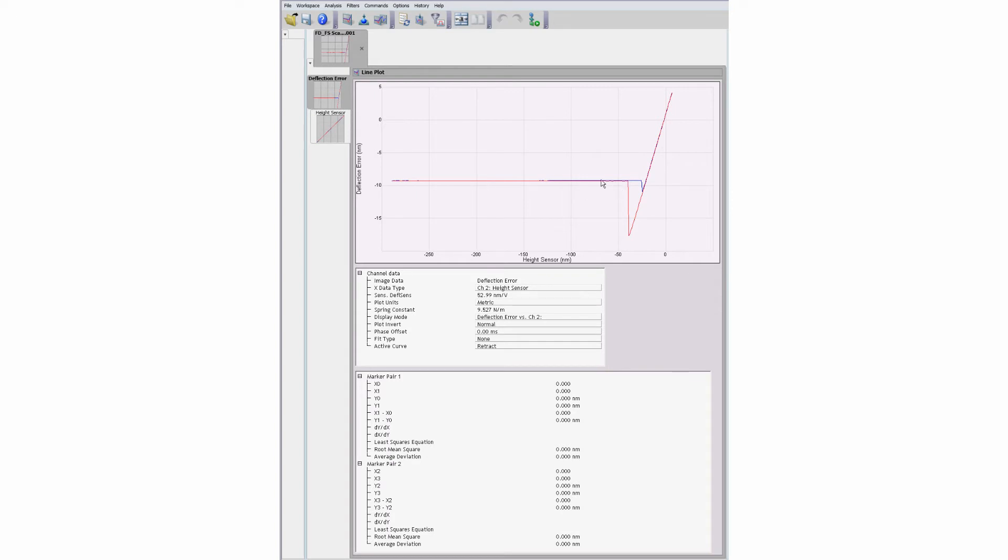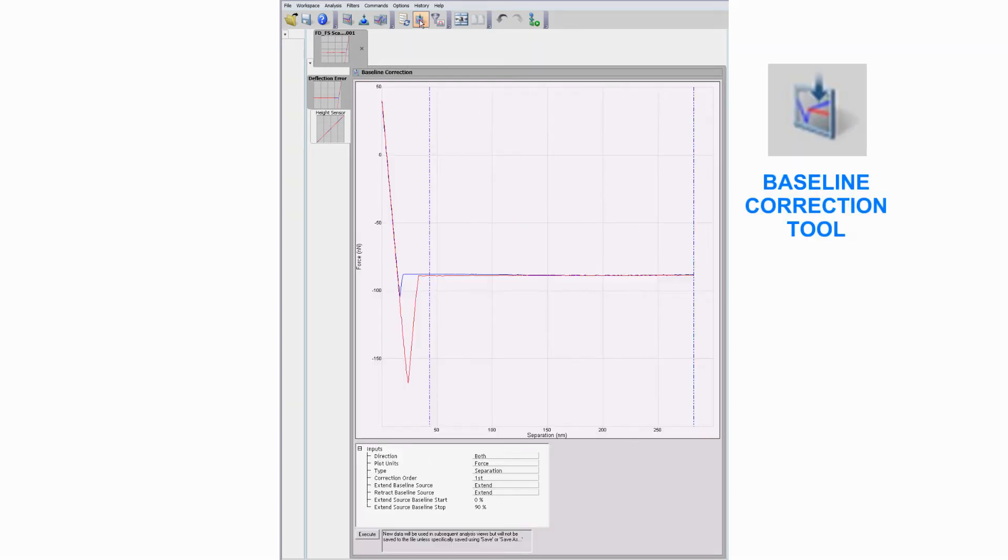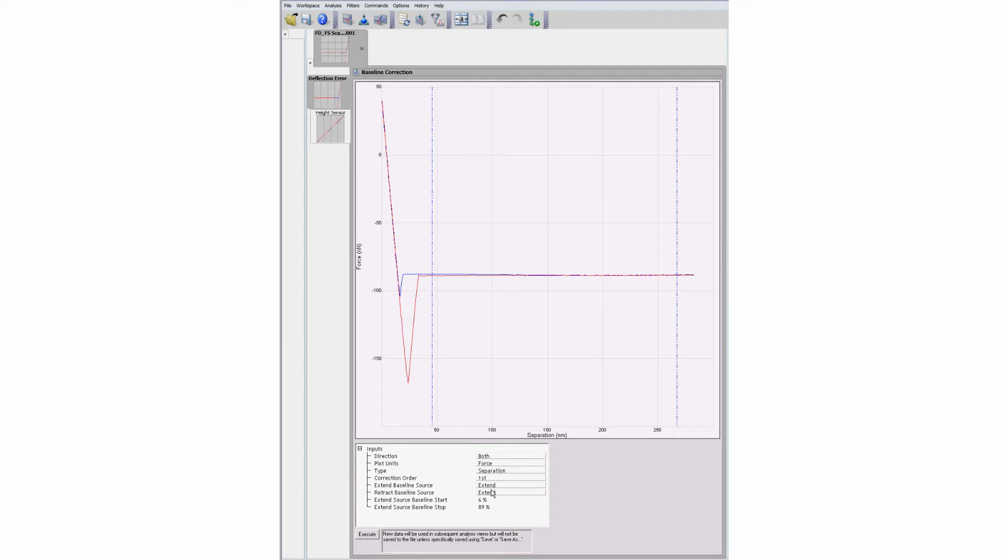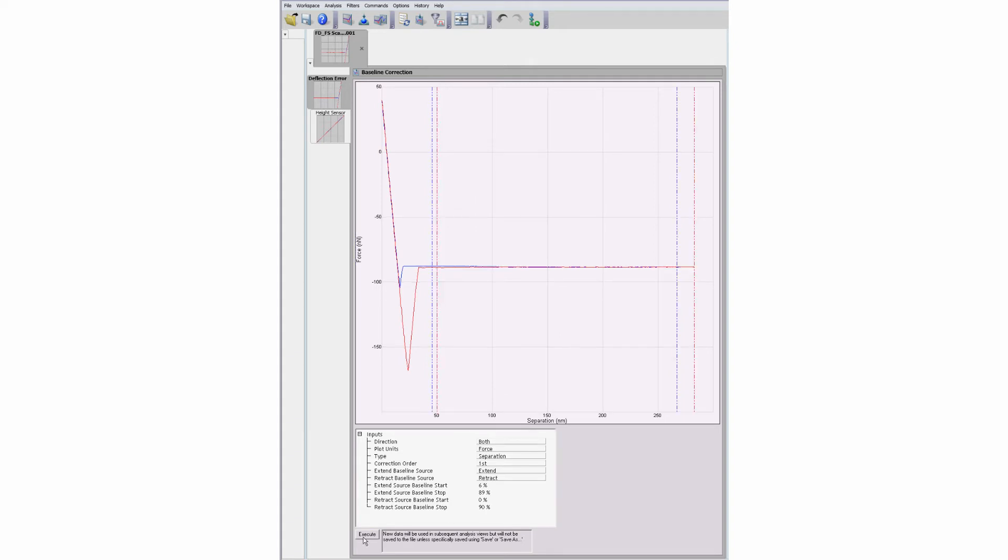Force curve files can be opened for offline review or processing. The baseline correction operation can adjust the original measurement offset or tilt. Use the movable cursors to select the desired section of the curve for correction, choose the data plot options, and then execute the operation to force the curve to the zero reference value.